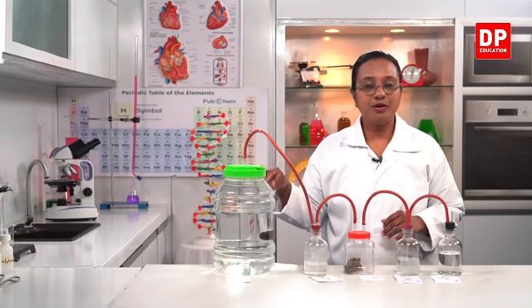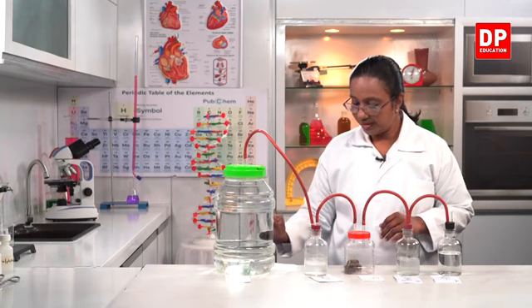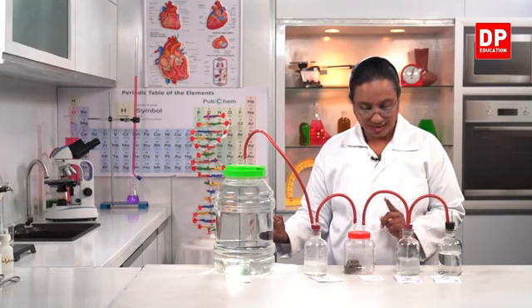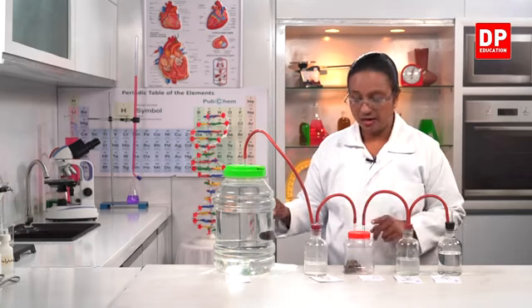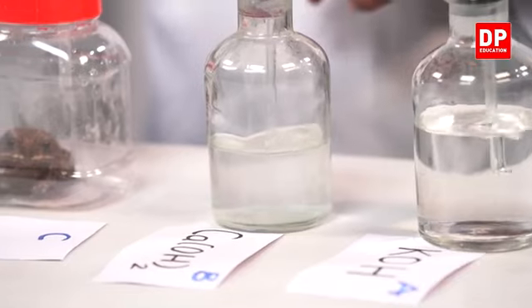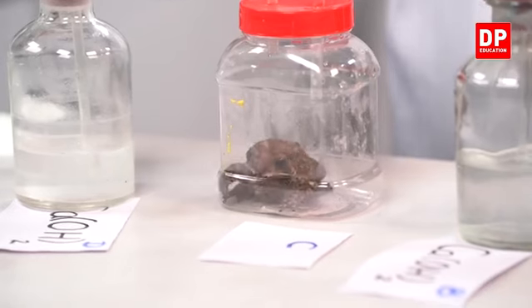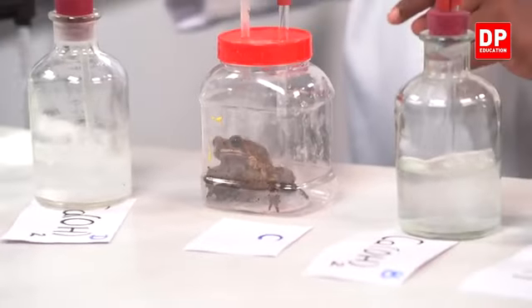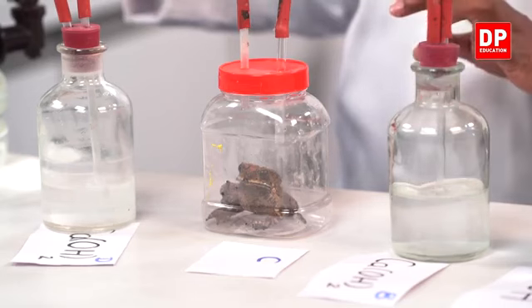You all know why we are having all these bottles. Now I am going to open the tap so that the water will release, and you all can see the air flow, the bubbling of the gas. Observe bottles B and D carefully. You also can see the frog breathing. When I open the tap only, you all see the flow of air. When we close the tap, there is no air flow.